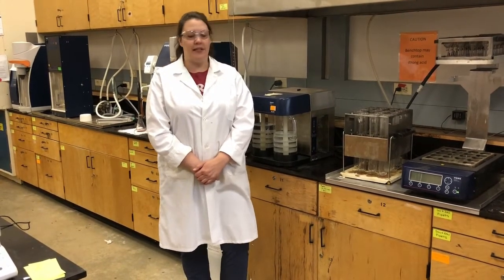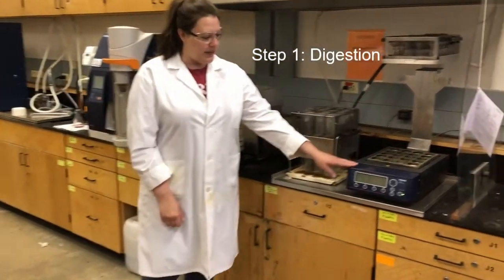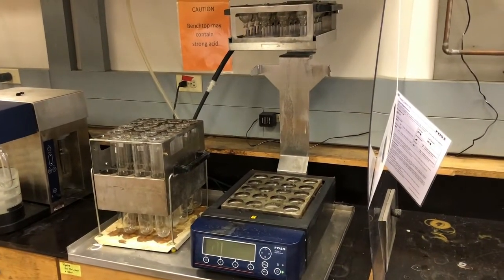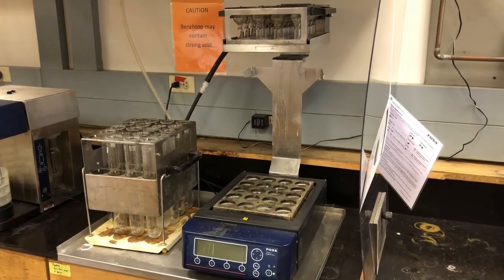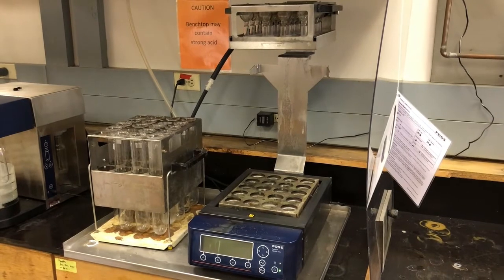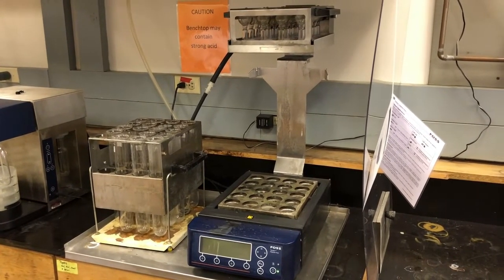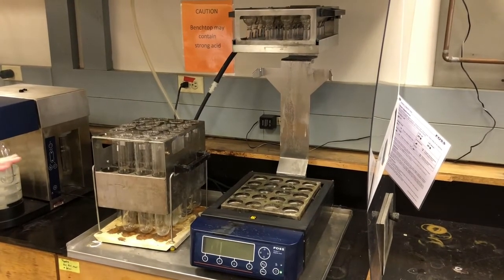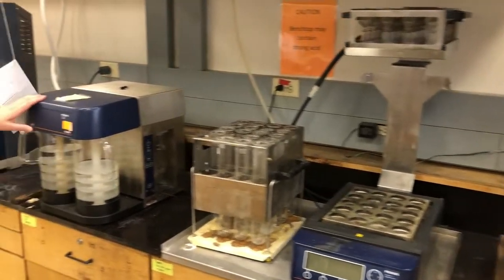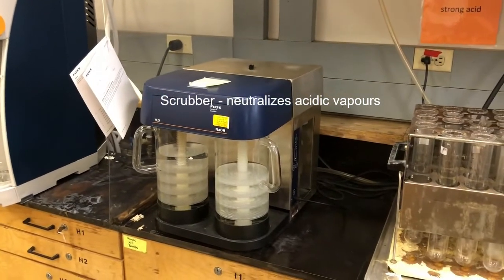So it's a three-step process that we're going to go through. It starts with the digestion. Right here we have a digestion block, and this heats up the sample to a really high temperature and digests the sample with sulfuric acid and a catalyst to break down the organic nitrogen into ammonia, and the ammonia reacts with the sulfuric acid and produces ammonium sulfate. That runs for about half an hour or so, then we let the tubes cool down. This is a scrubber, which cleans up any of the harmful vapors that are given off. I'll explain that in more detail later.